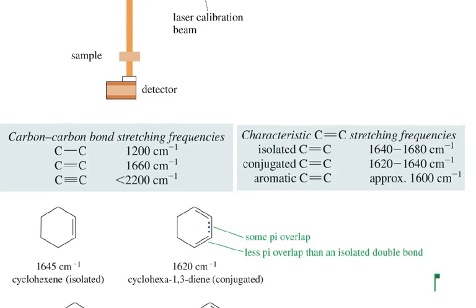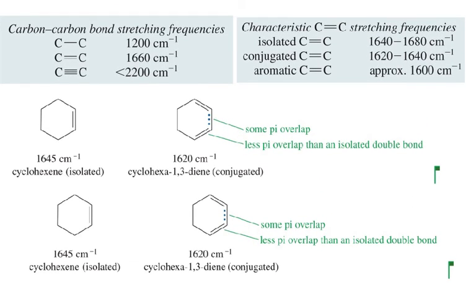So going back to the beginning, now that we've seen an IR spectrum and are curious how to decode it, we can look at different carbon-carbon bonds. You can see that the alkane carbon-carbon bond is not useful to us, because 1200 is in the fingerprint region. The carbon-carbon double bond is going to go at about 1600, and sometimes that's useful. The thing is that when we see CH stretches, those are a lot more useful, so we don't really care about the carbon-carbon bonds.